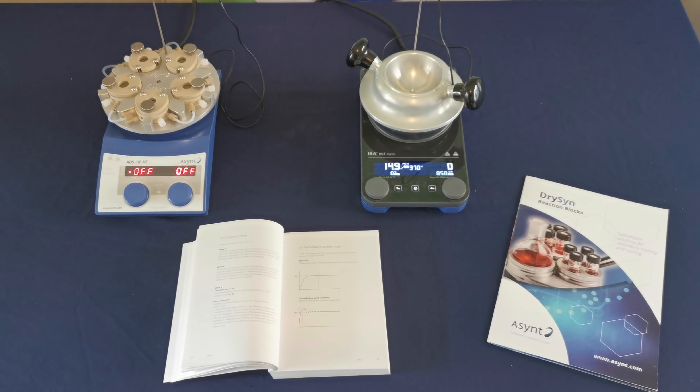Did you know that there are two heating modes for both of these hotplates? We have PID mode, which is slow and more controlled, and we have 2P mode, which has the maximum heating rate but with an increased overshoot of temperature initially.